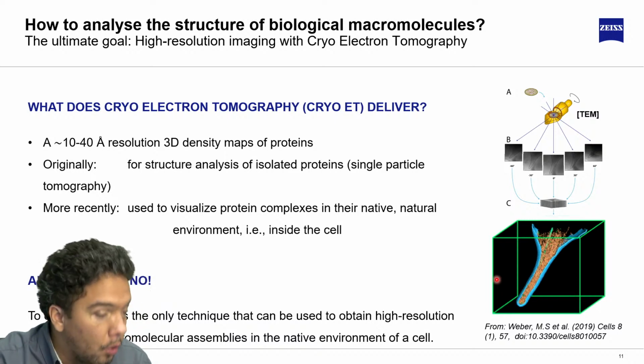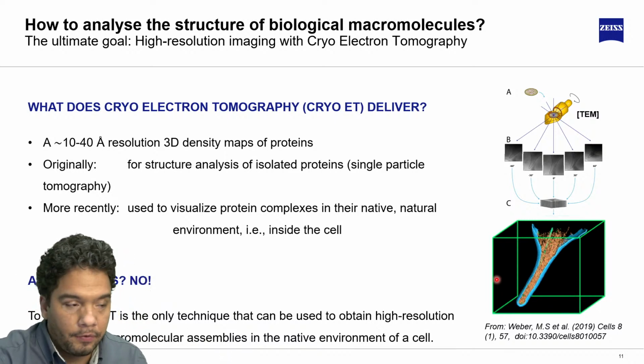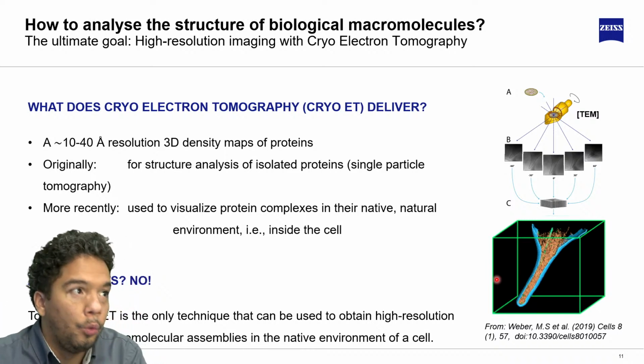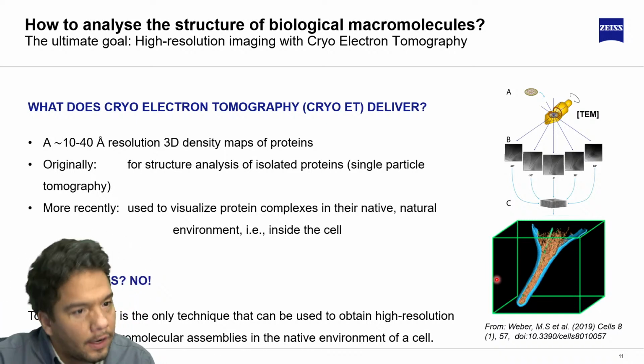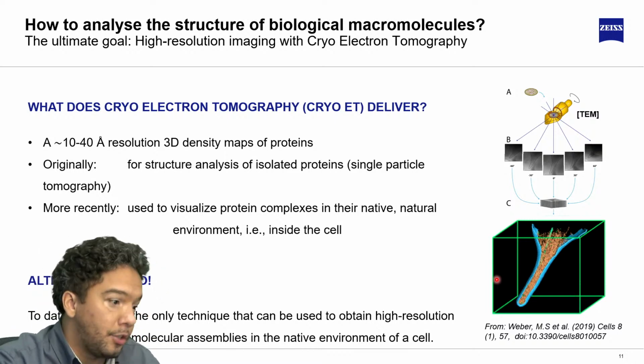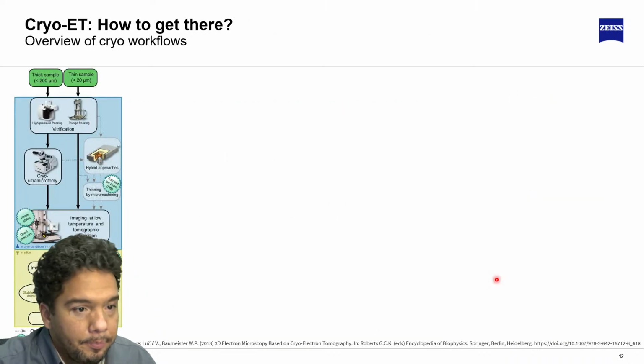Do we have alternatives? The answer is no, because as we mentioned before, other techniques introduce artifacts, and we don't want to study that kind of artifact. We don't know if that artifact came from our sample or the preparation. To avoid that, this is the technique.